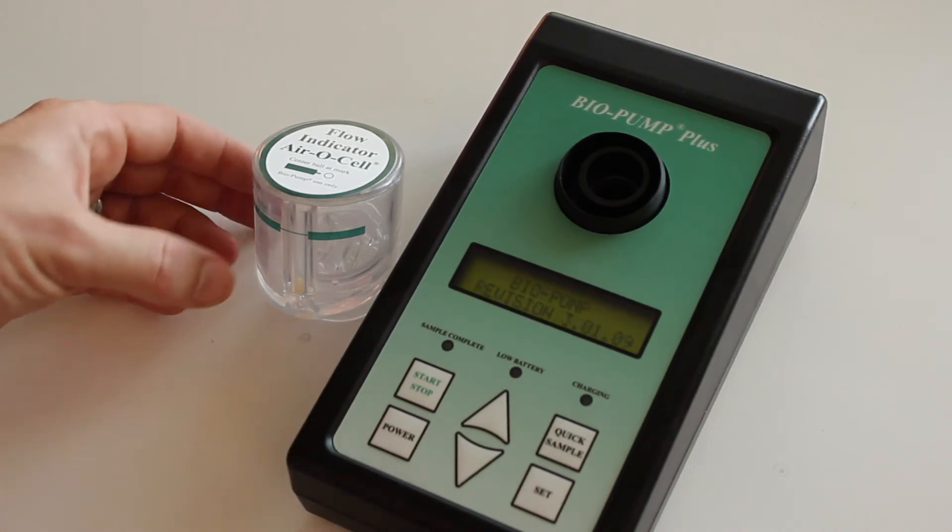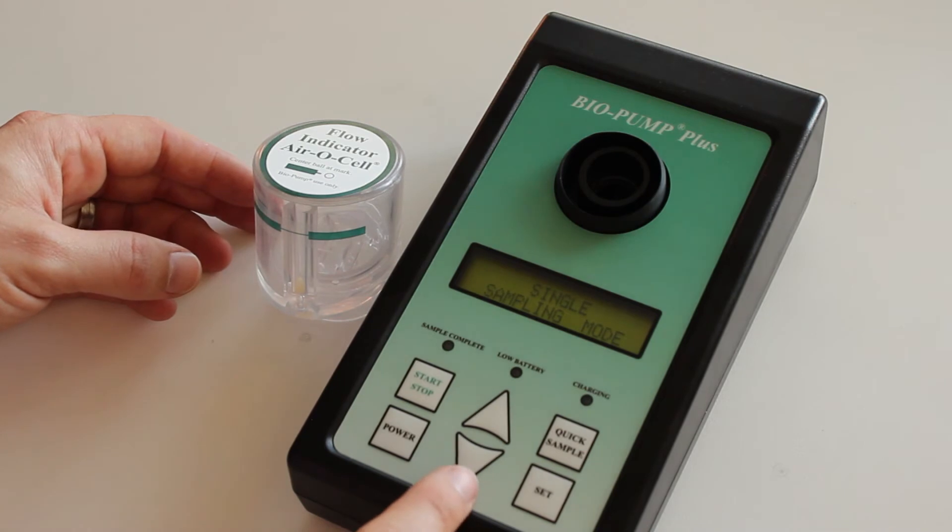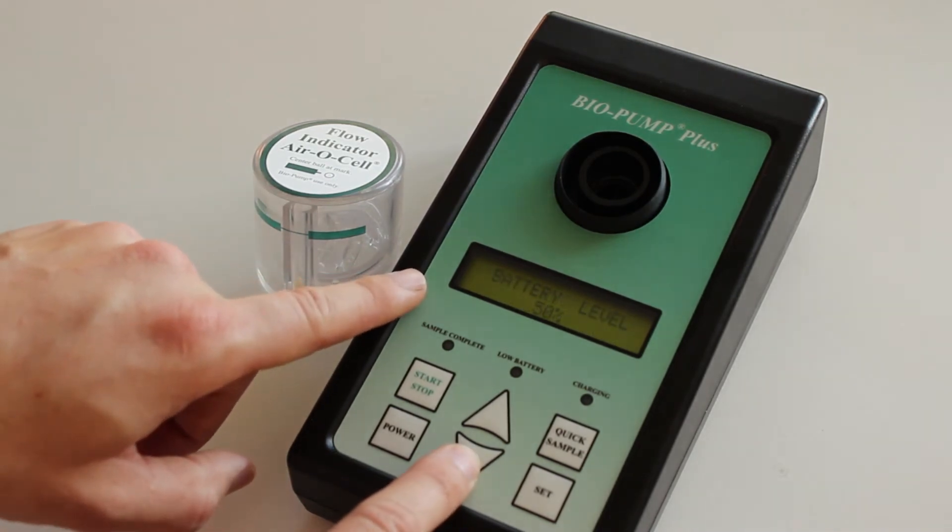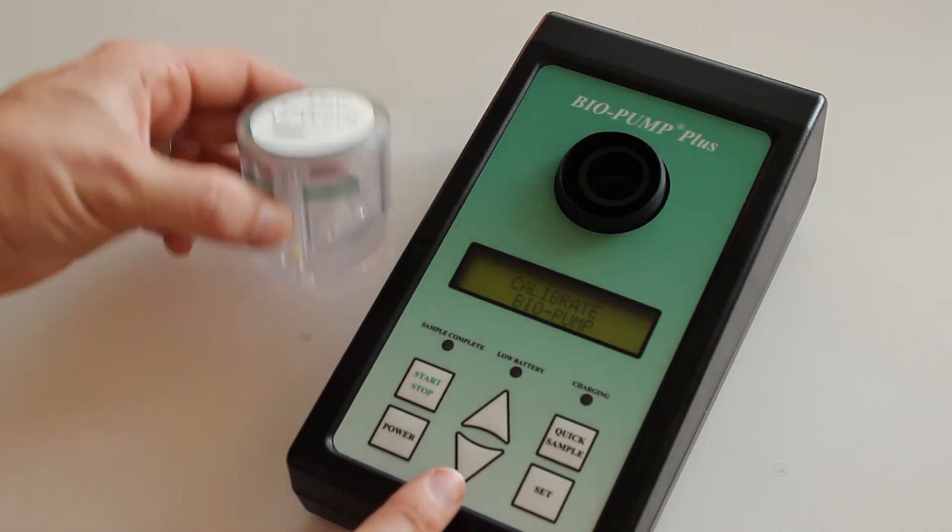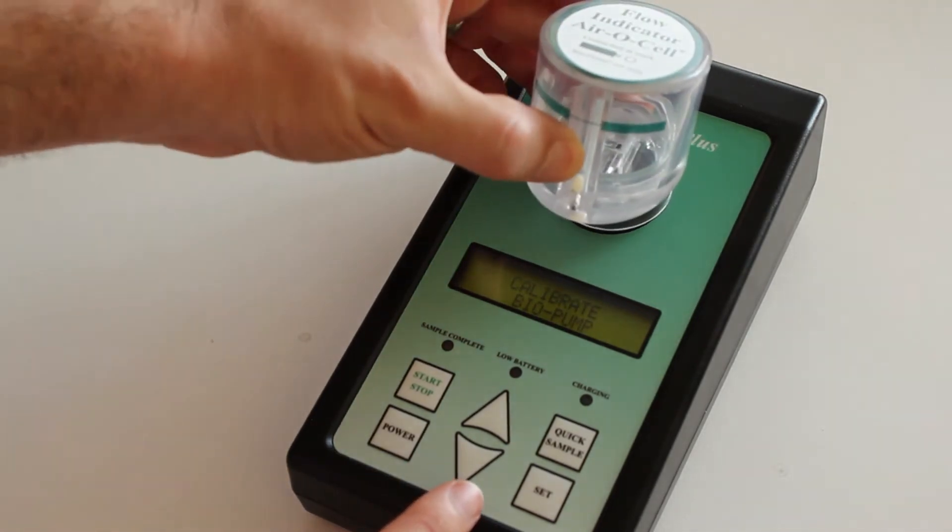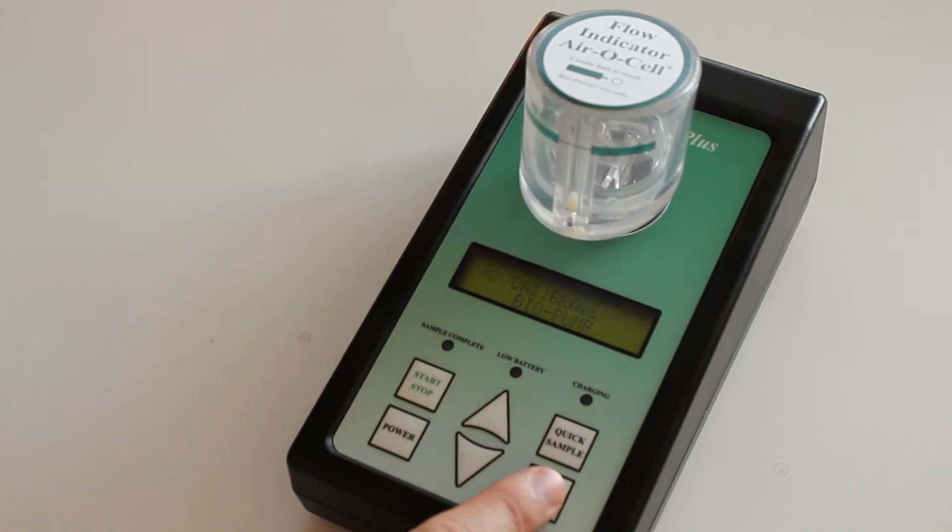Power on, wait for it to load. You'll press down, battery, down again, verify calibration, one more time to calibrate pump. What you'll do then is you'll place the flow indicator on here and press set.